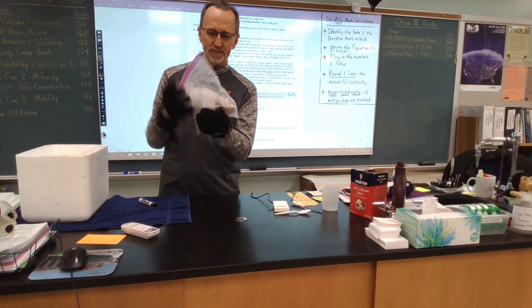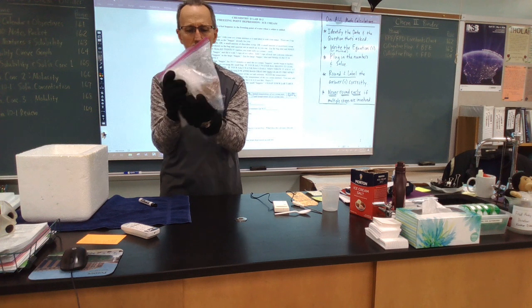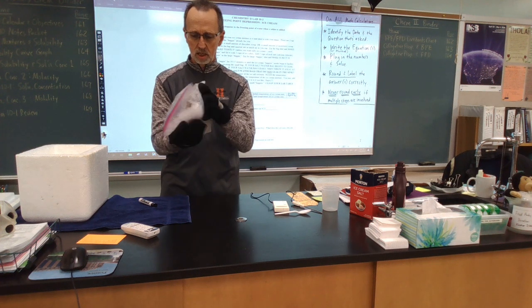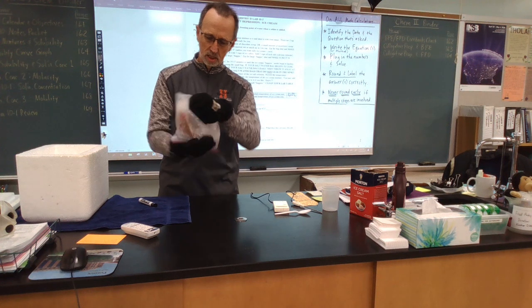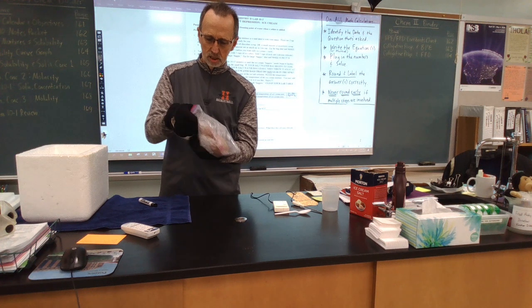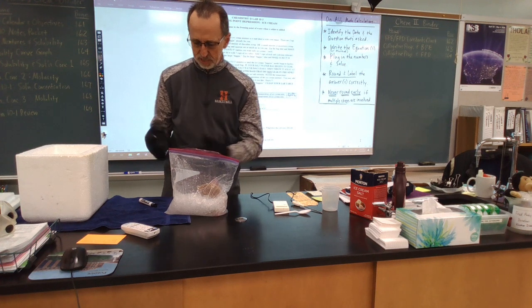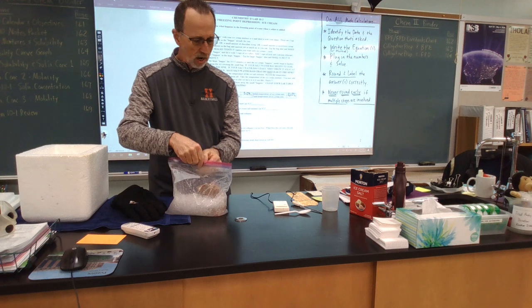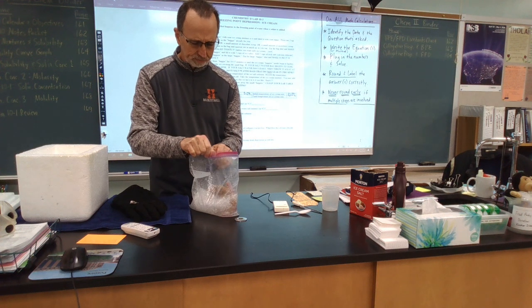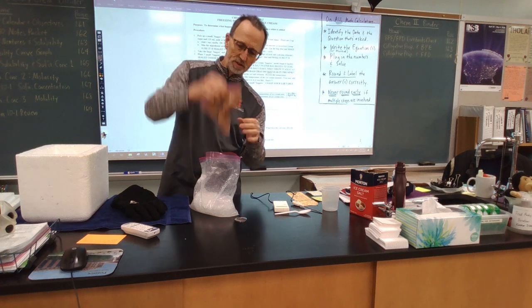A little easier to eat that way. So I don't want to leave it in here much longer. I think I'm done. Good enough for me anyway. All right, so 2 things. Oh yeah, definitely frozen.